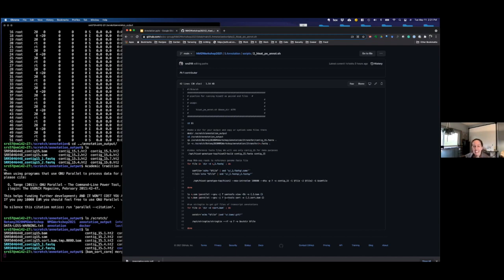Okay. Oh, computers like it better. Yay, Andrew, bailing me out. Yeah. So one of the really good things is that BAM is like a compressed SAM. So it's more efficient, it's better on disk space. And generally, most of the downstream packages you'll find want things to be in BAM format. So once you have it in BAM, you can essentially delete your SAM files and it'll save you some space on your machine.